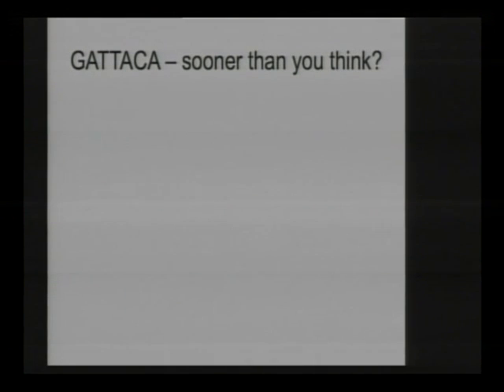When I say the sequencing is still too expensive, and maybe it also takes too long, because one run can take several days on Solexa. Maybe that doesn't concern us yet. However, there are a few companies who are developing the next generation sequencing.